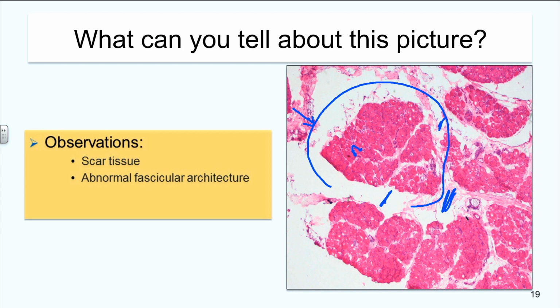the endomysium where the myofibers are supposed to be in contact together. You see fatty infiltration in some areas. The areas that are falling apart, kind of, it's fat, because fat doesn't cut very well on the frozen section. And also, you know, you can see the areas of cellularity which signals degeneration.